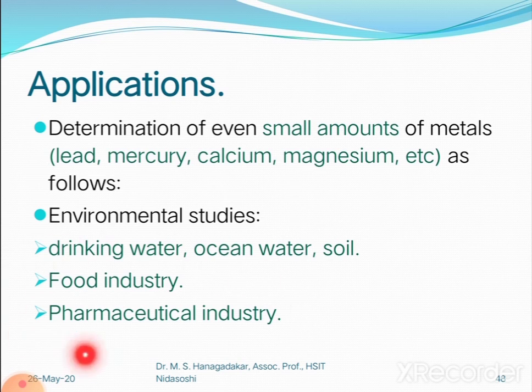Also, pharmaceutical industries, meaning medicinal manufacturing industries, are a very important part of our life. From the medicines we get desired elements or desired components, which give good health for maintenance. Whether they are present in the appropriate range, that can be analyzed by the atomic absorption spectrophotometric technique.